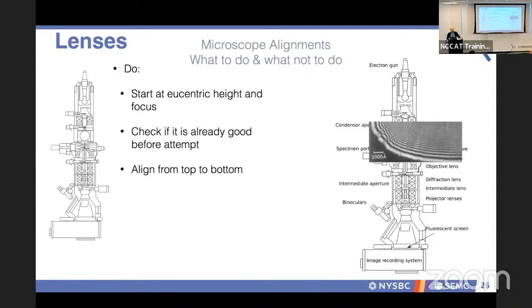There is a particular range that your lenses can reach. On certain systems that are not constant power, what ends up happening is if you send current through the lens and the temperature changes, then you have different resistivity. So that could cause hysteresis. Though you're sending the same current through the lens, you might have a differing effect. So constant power lenses sort of minimize that hysteresis, and it can be quite stable, like on a 3-condenser system, for example, a Krios. A Glacios that we have is a 2-condenser system, so we have less range that's parallel, and you might notice more hysteresis.